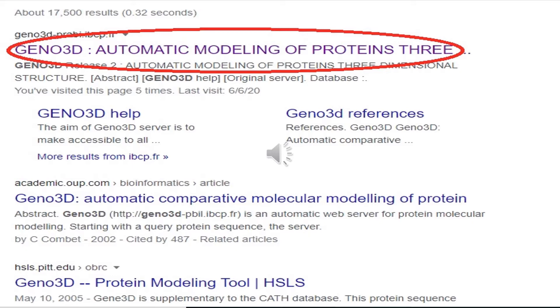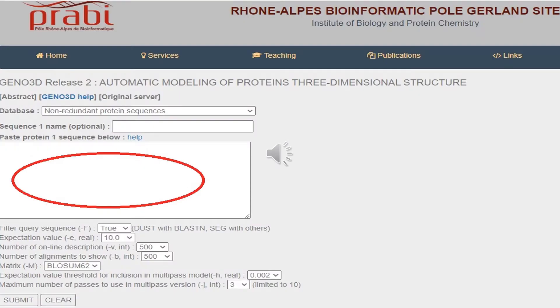Always remember, homology modeling of protein is extensively based on the BLAST program. When you open the Geno3D homepage, the page will appear like this. You have to paste your protein sequence in the box marked with red color, then submit your sequence. The aim of the Geno3D server is to make automated protein modeling accessible to all biochemists and biologists to generate a 3D model.